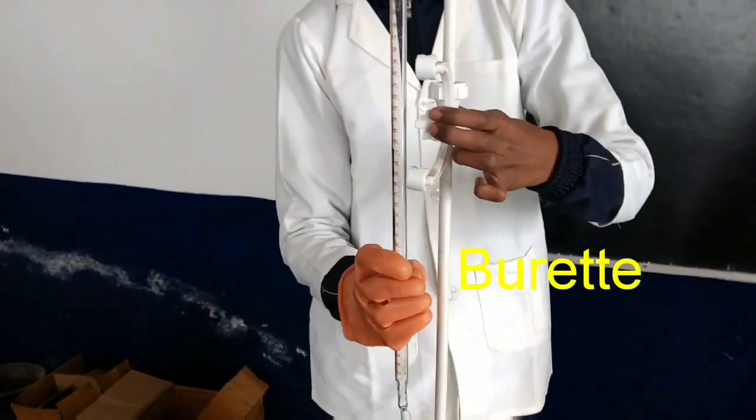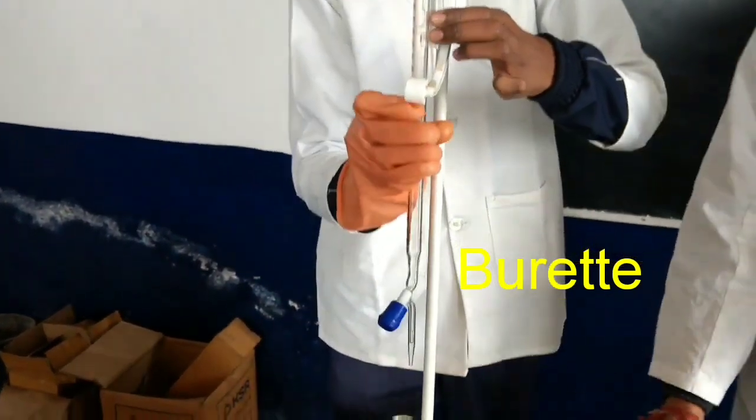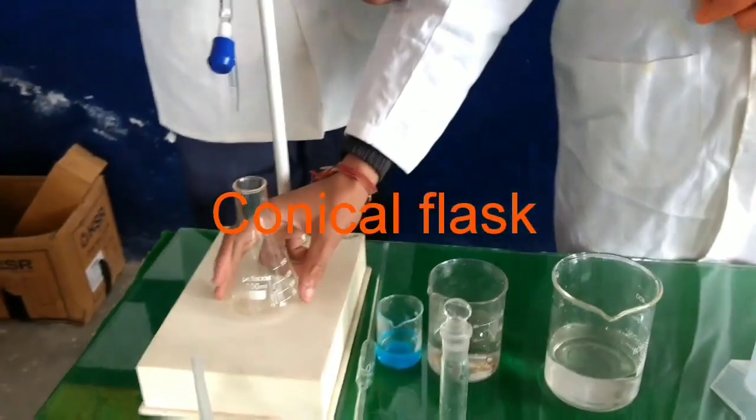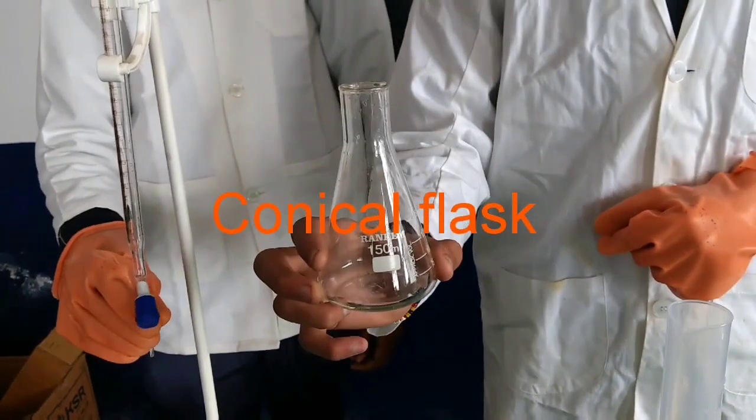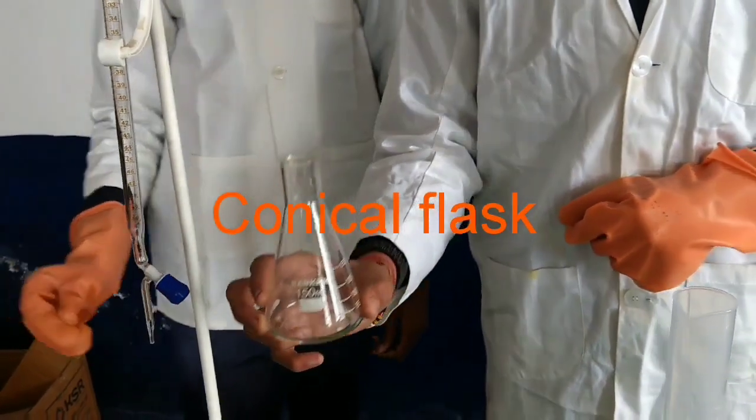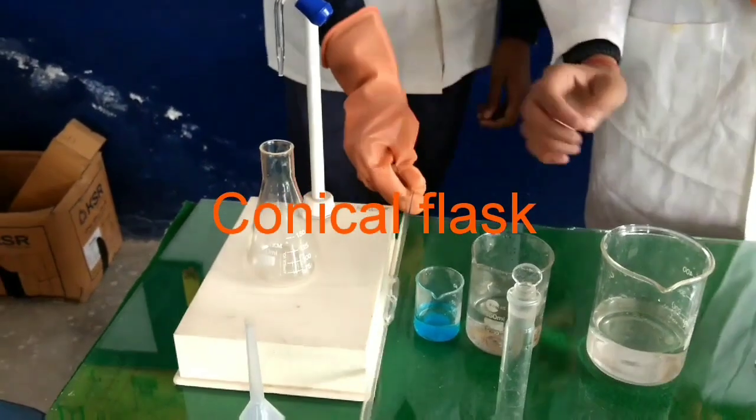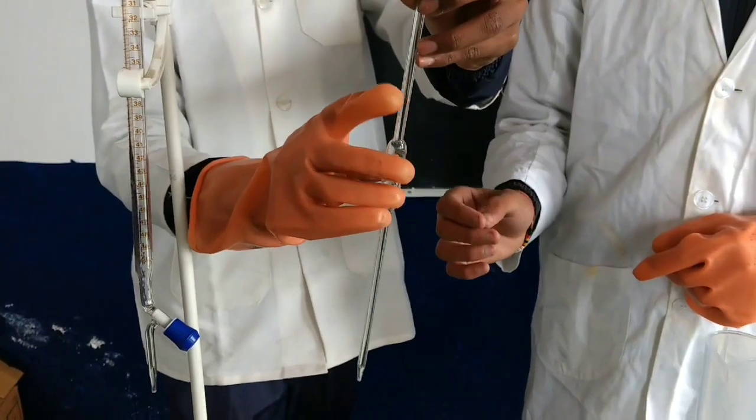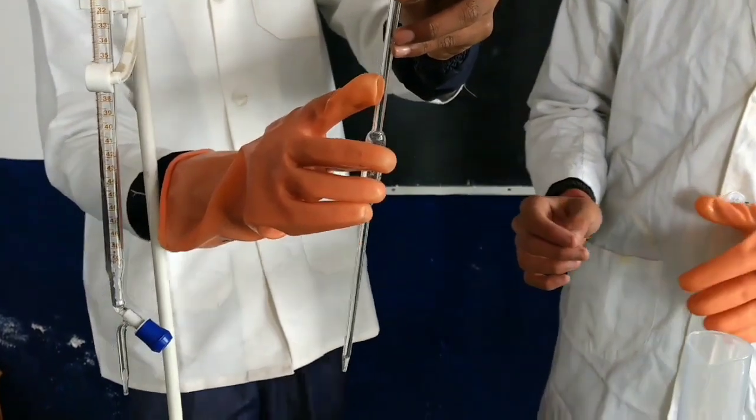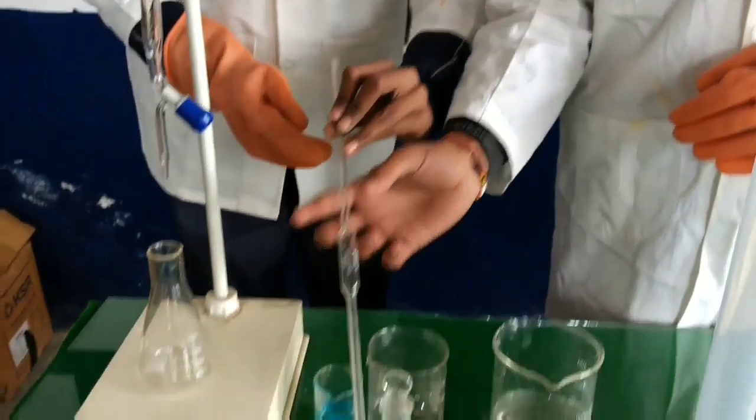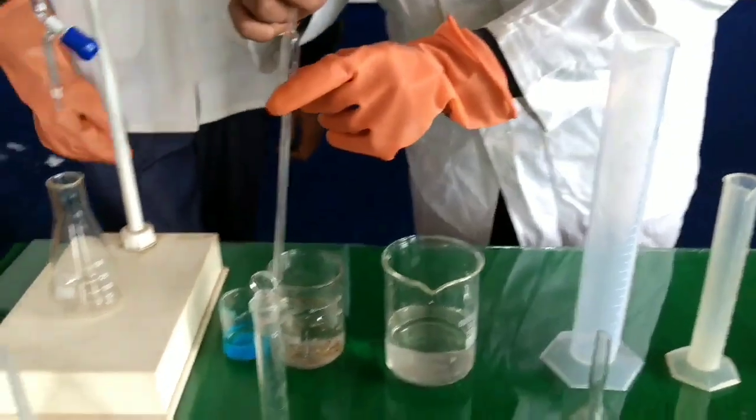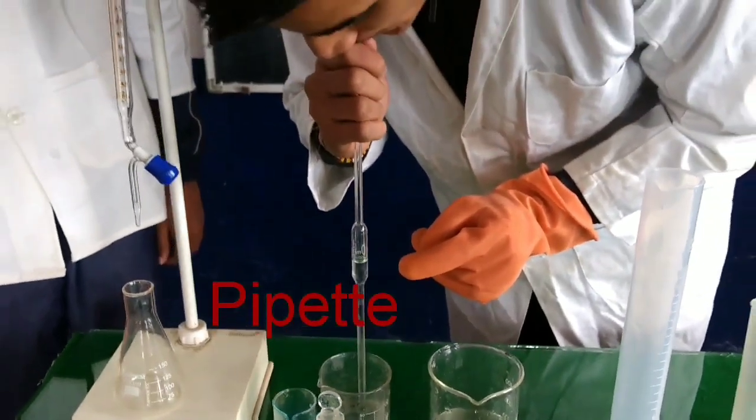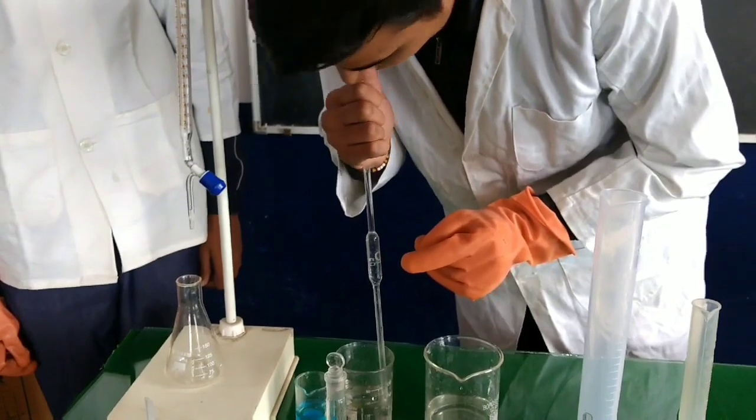Next is the apparatus for the volumetric analysis. This is a burette in which we fill unknown compound for the titration. And it is conical flask. After this, we are seeing the pipette. Pipette is used for pipetting out the unknown solution during the volumetric titrations.